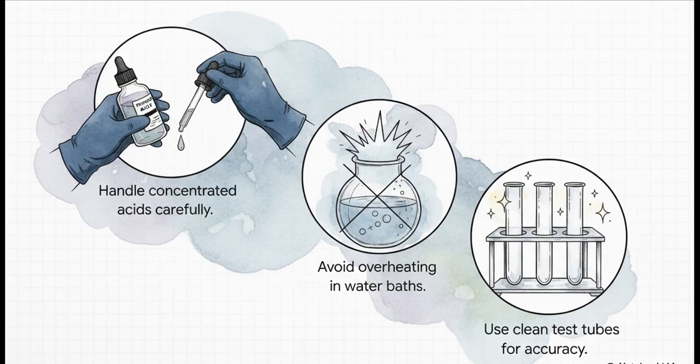First, as we saw in the Xanthoproteic test, you must handle concentrated acids like nitric acid with extreme care. Safety gloves are totally non-negotiable. Second, avoid overheating during those water bath procedures. Too much heat can literally ruin the very color complexes you're trying to create.